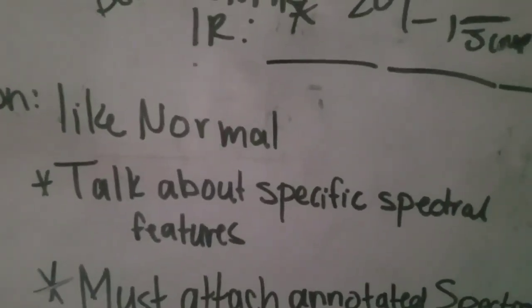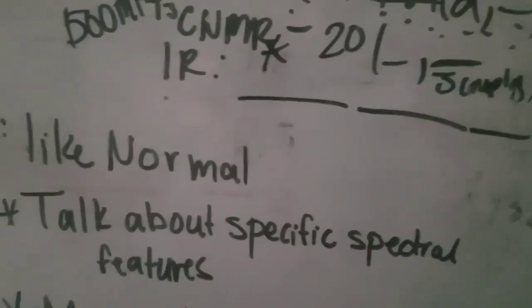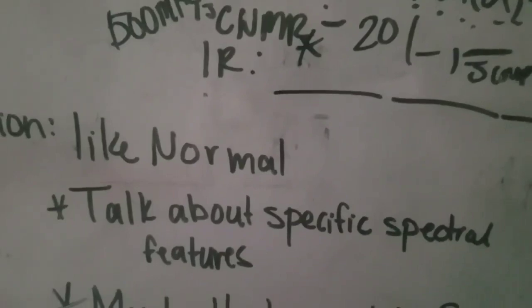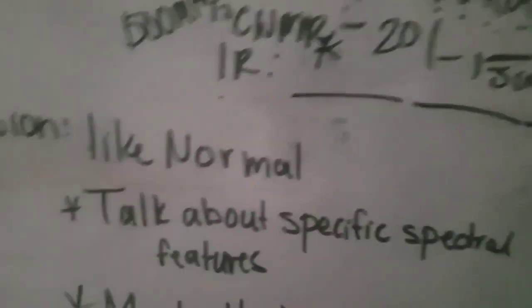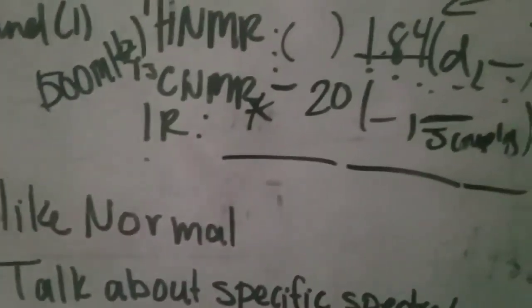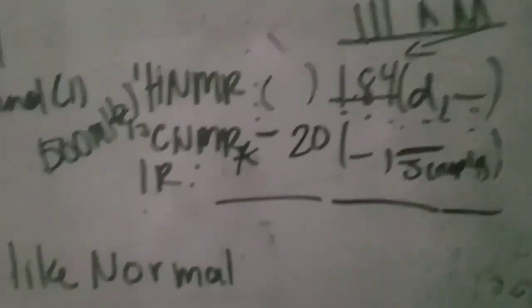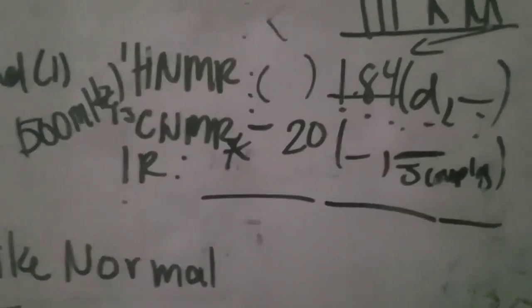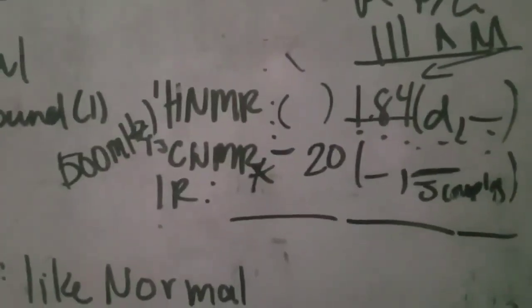the spectra that lets you know that that's that compound, right? So you went through and you labeled the spectra, specifically what on that spectra is a specific characteristic for that compound. So for example, I know ibuprofen has an amide group or something, which it doesn't. It's an example. Ibuprofen has an amide group. So if that's the case, this peak here is an amide signal based off this. So I know this has to be what it is.